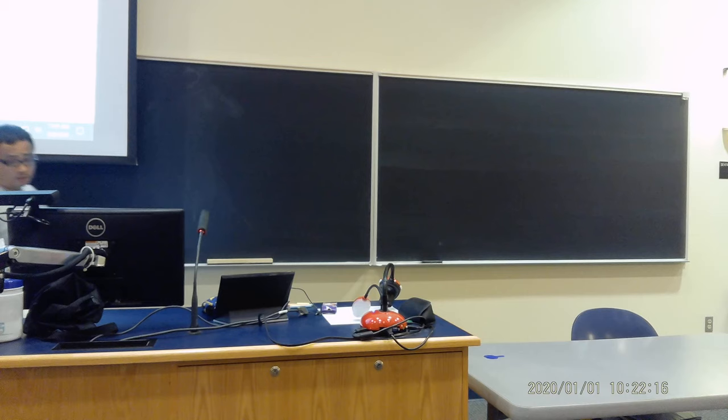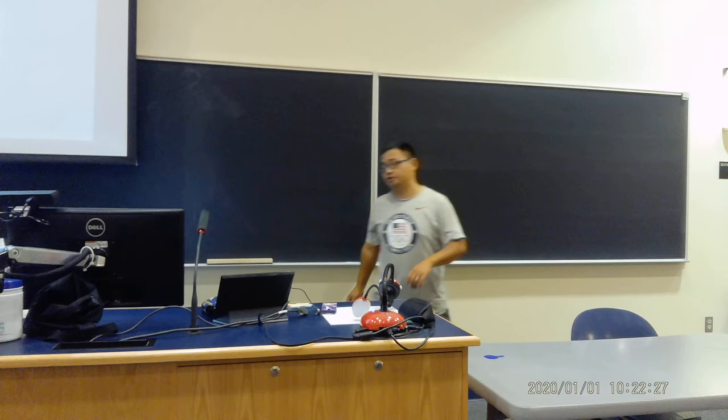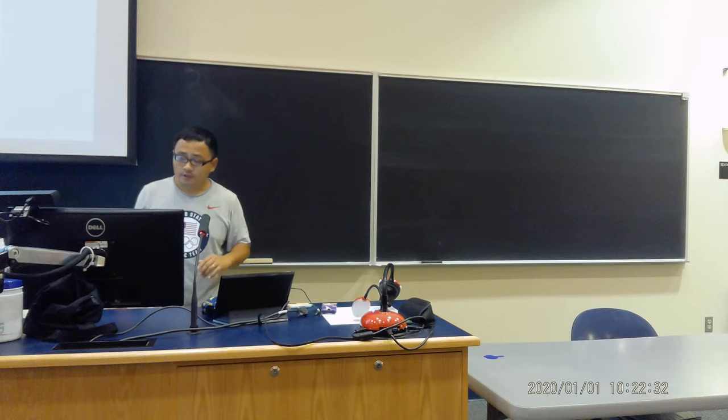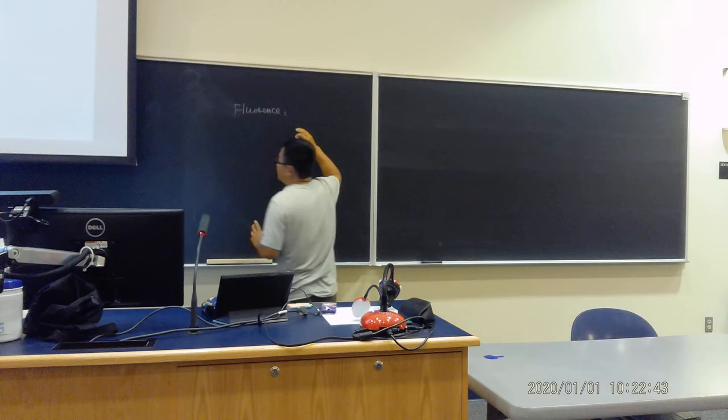Okay, I want to say today's lecture is important because we're going to go over lots of information regarding the staining technology. So first of all, we're going to finish talking about the microscope. First is the fluorescence microscope. Now you need to know what fluorescence means. This is a color.